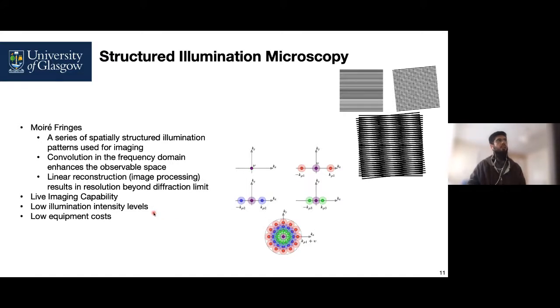Now, some of the advantages of this structured illumination microscopy technique are that we are still able to observe samples in real time.